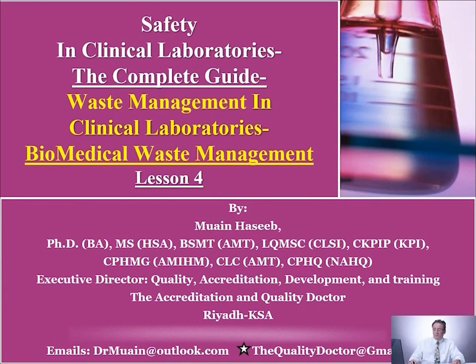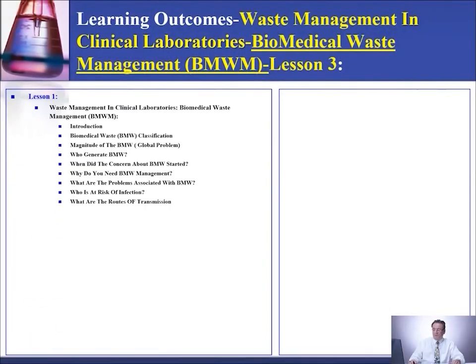Management in clinical laboratories. In lesson 1, we started talking about biomedical waste management, BMW management, and gave you an introduction. Then we talked about biomedical waste classification, the magnitude of BMW and who generates it. When did the concern about BMW start? Why do you need BMW management? What are the problems associated with BMW? Who is at risk of infection? And what are the routes of transmission?